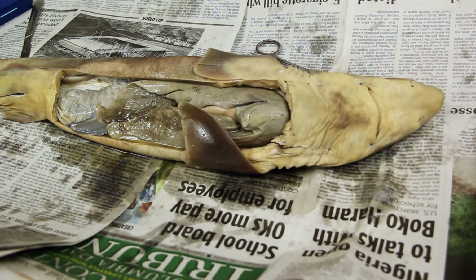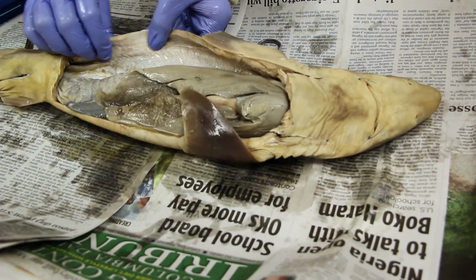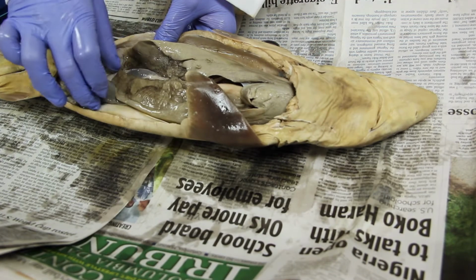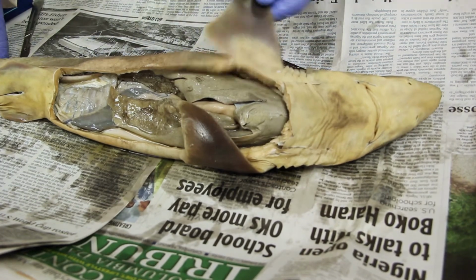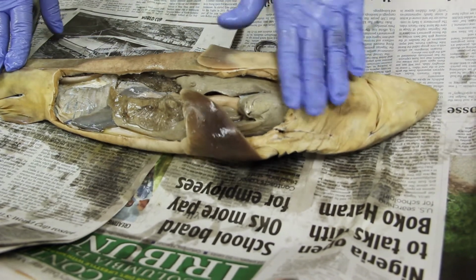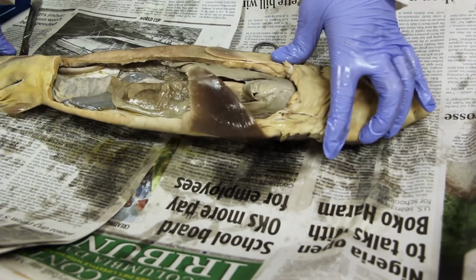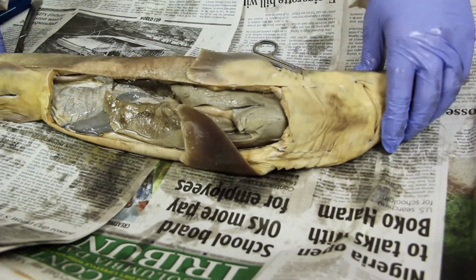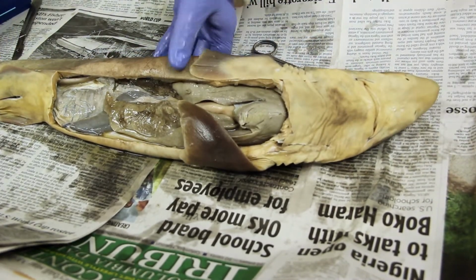So that's basically all that we have for you today. You saw the internal anatomy, and you saw the external anatomy. The spiny dogfish is really similar to any other shark, and so it's a great thing to dissect because then you can just learn more about the shark's body.